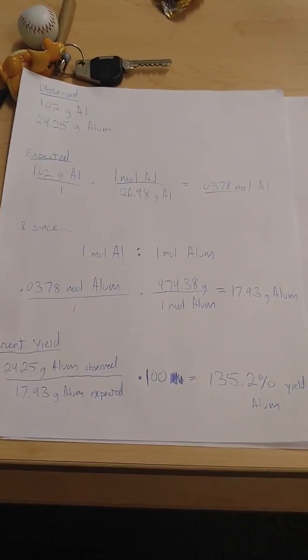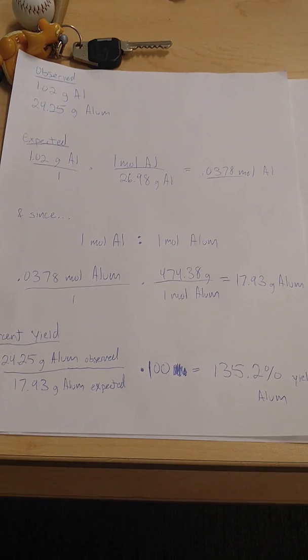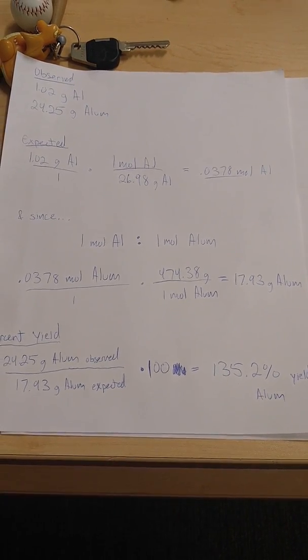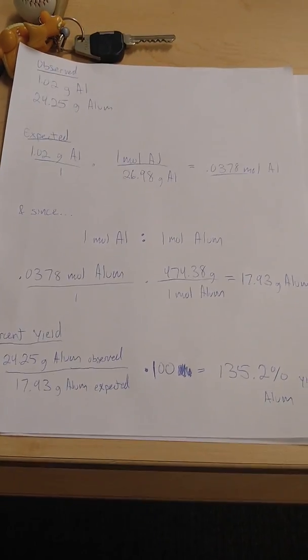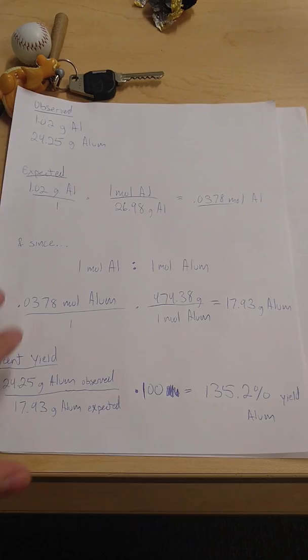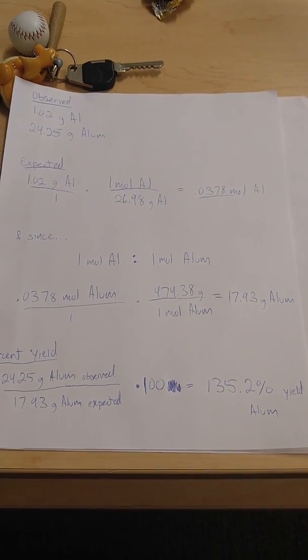In our case, we washed the alum excessively, meaning that throughout this process, water probably got stuck inside of our sample of alum, accounting for the huge extra weight. So about 7 grams of water were probably in between the alum.